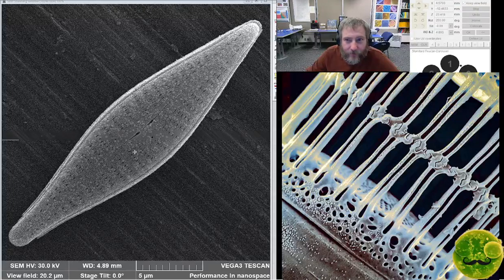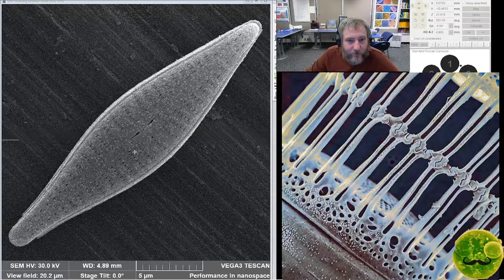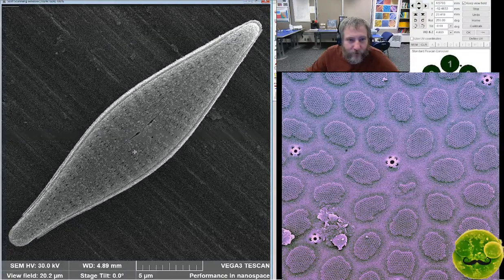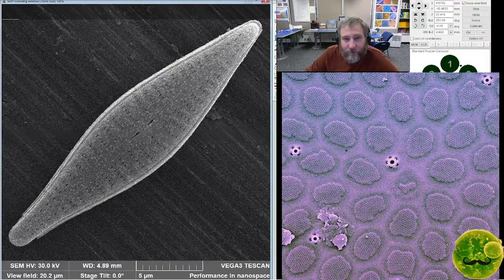Brightness and contrast settings are taking a while. I suppose I could have just left them alone, but it seemed like they were a little bright up here at the top, and it did adjust to darker, so.